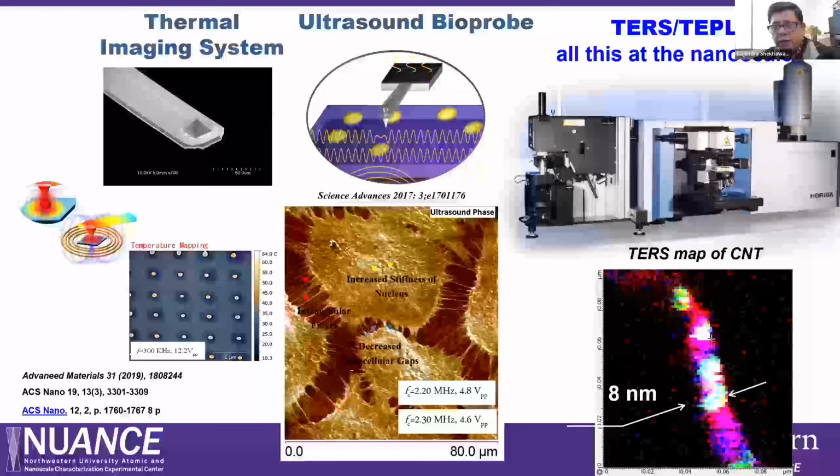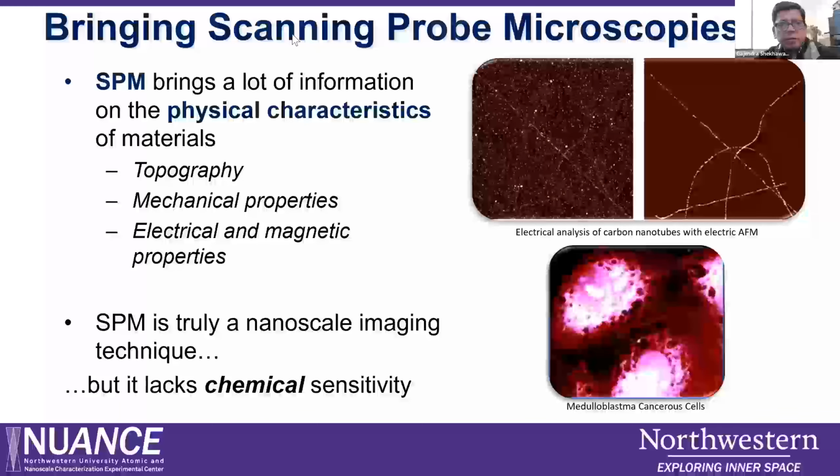On the right is the newly installed scanning Raman-TERS system. I will explain in detail some of the capabilities the system has.